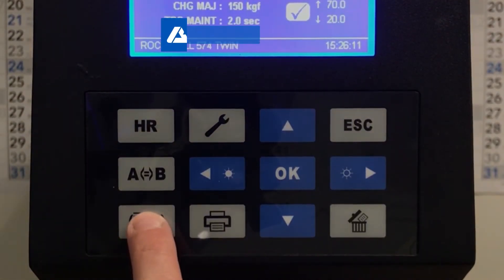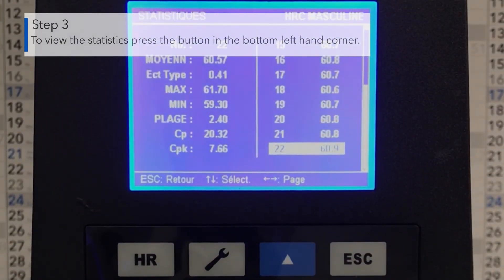To view statistics from the previous indents, press the button in the bottom left hand corner.